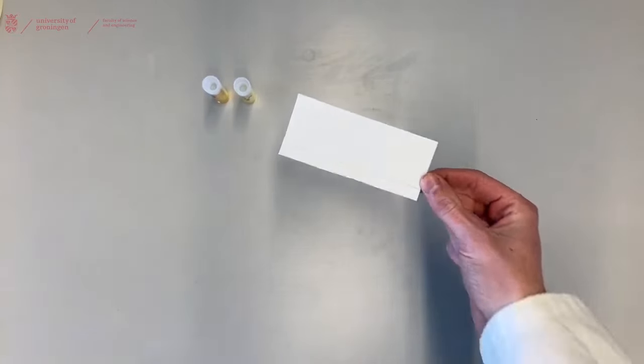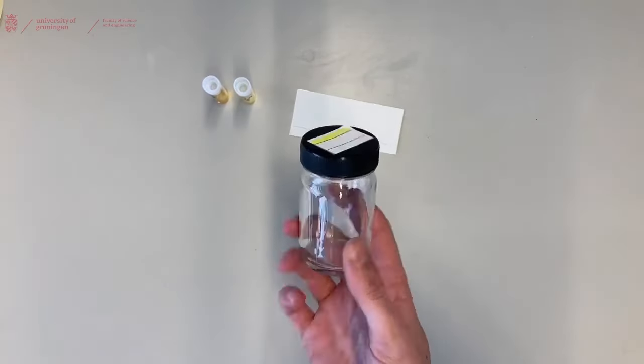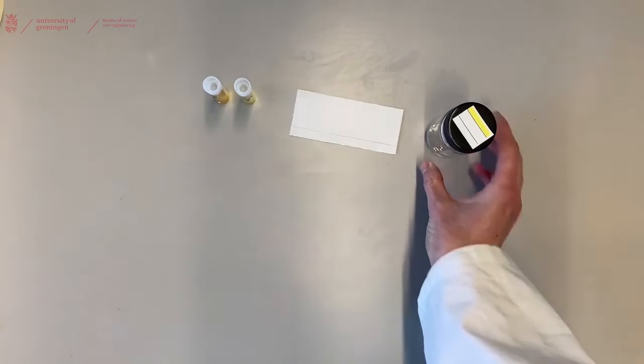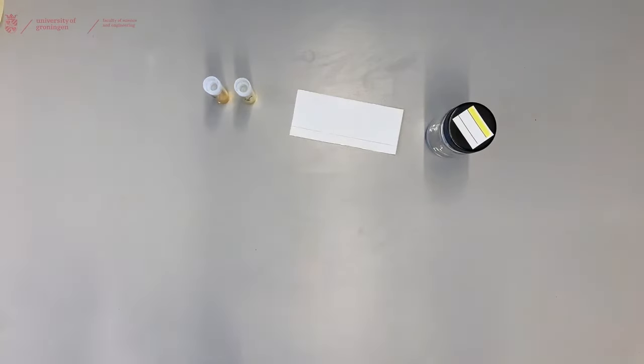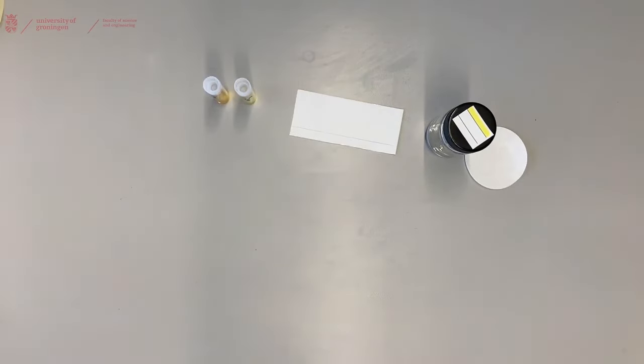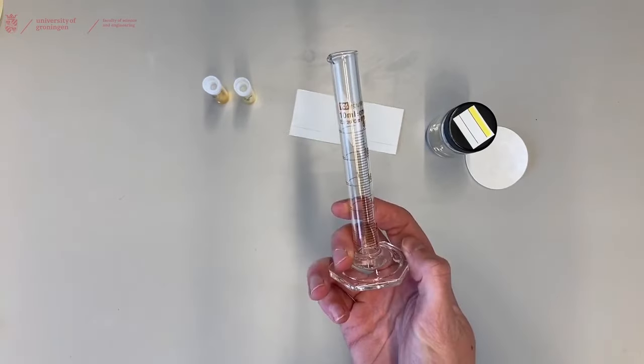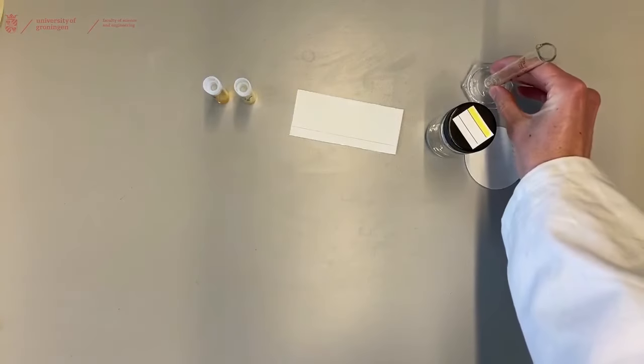You will need a TLC plate, a jar to run the TLC in, a piece of filter paper that fits in the jar, and a measurement cylinder to measure out your solvent that you are going to use for your TLC.